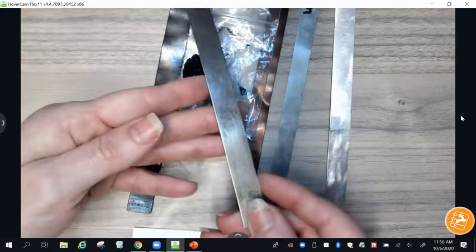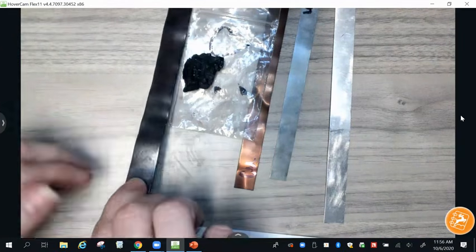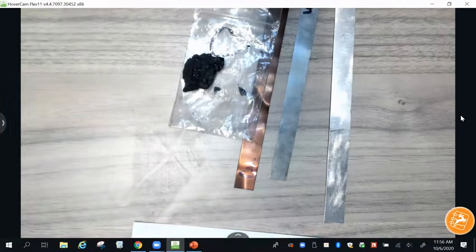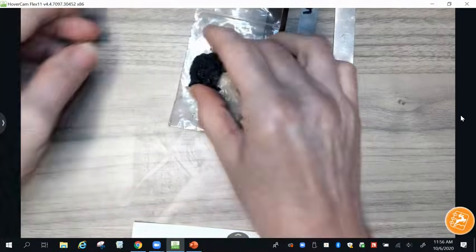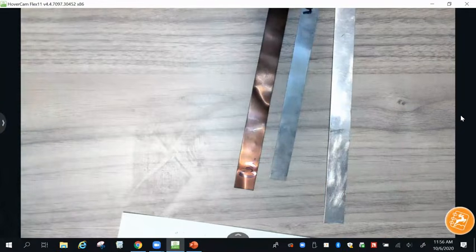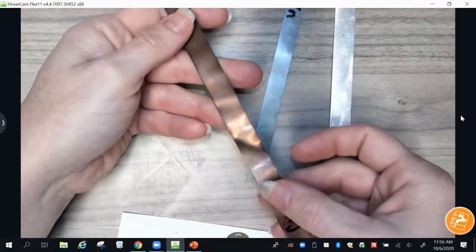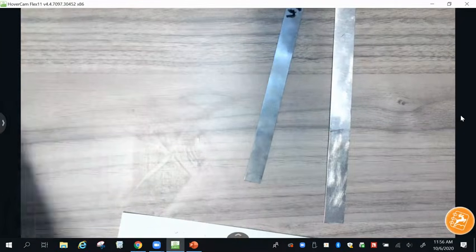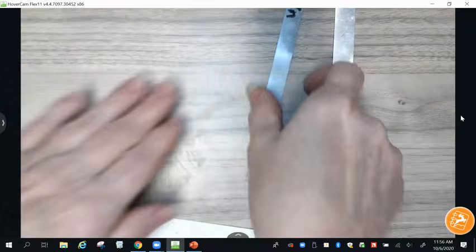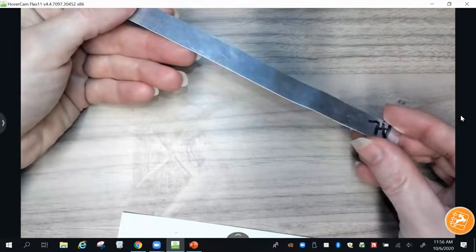Yeah, I have them in order. This one's iron. Then we have lead. And then carbon. Okay, lead. This one is carbon, right here. Okay. And then copper. Everyone knows that's copper because of the color. Copper. And then this one is zinc. And then we also have aluminum.